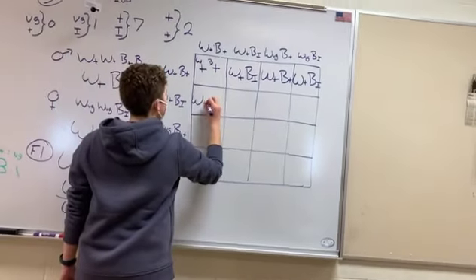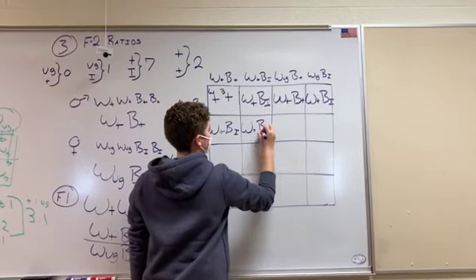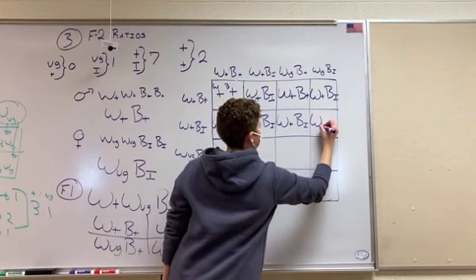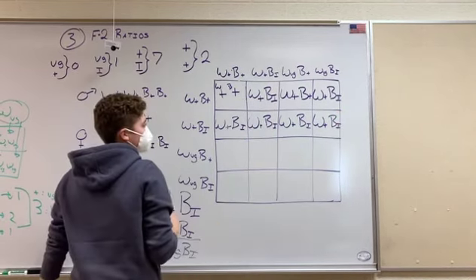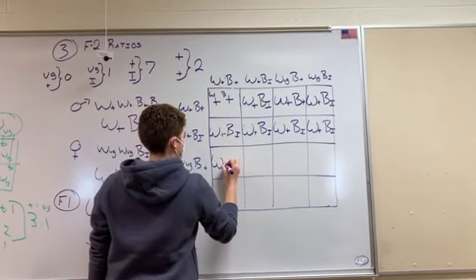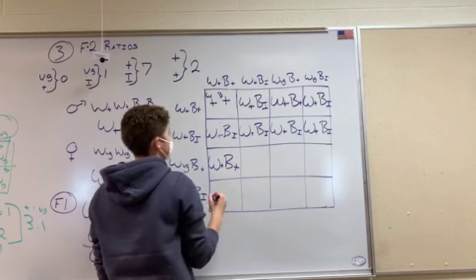Wings, wilds. Body. Got our eye here. Body yellow. Okay. Halfway done. Whole row's the same there. Perfect. Yeah, the whole row's the same there because one of the progeny has both dominant alleles, so it's going to create all dominant offspring for both loci.